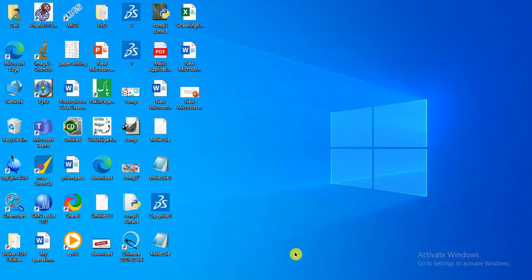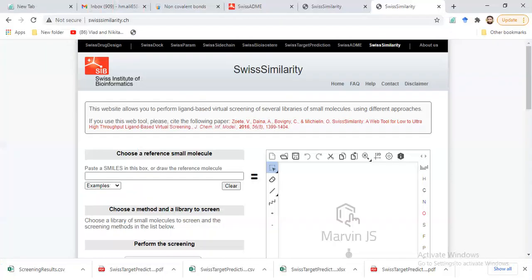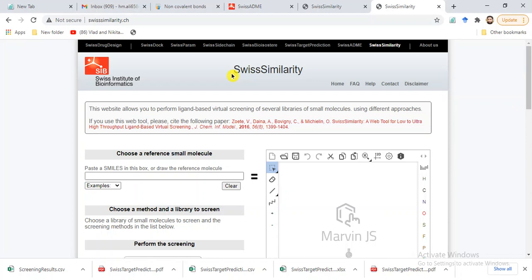Today I am going to show you how we can make structural analogs of our compound, or how we can perform ligand-based virtual screening of our small molecule. The software or online server we can use is Swiss Similarity, which can be used for screening of our compound against a large library of compounds.